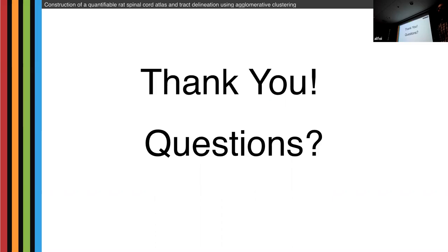Yeah, it's a good question because I've been asking myself that as well. Sometimes it's a 0.01 difference between different clusters. So it's not clear cut, right, where exactly you have the optimal number of clusters. So I would say I wouldn't rely too heavily on them. And this I didn't present, but you guys saw that the spectral clustering was really off in terms of the way it clustered, but it had the best validation scores.